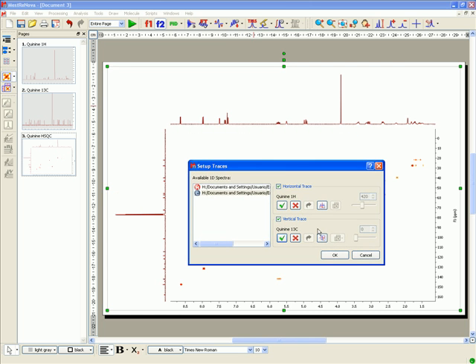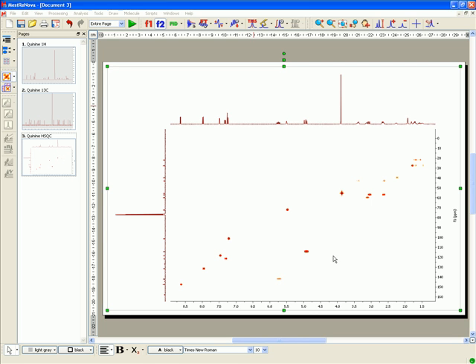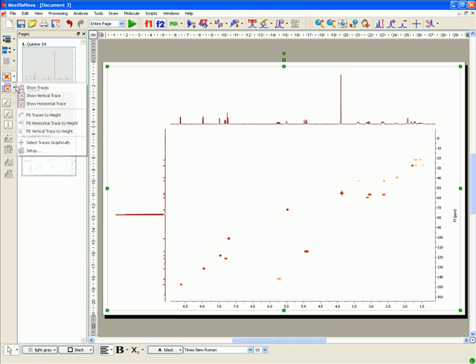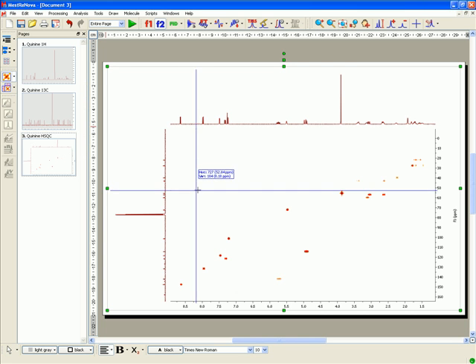You can also select the traces directly from the 2D NMR spectrum by using the Select Traces Graphically tool in the Show Traces scrollbar menu.